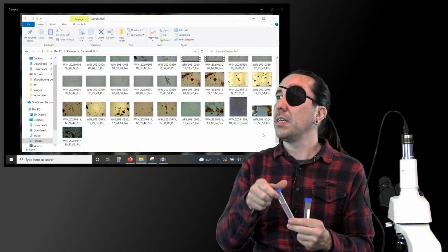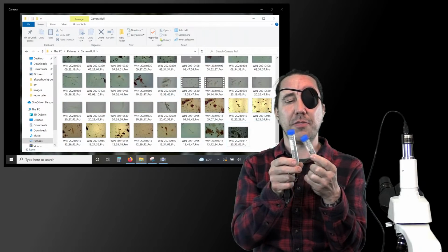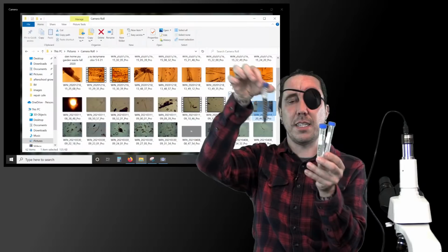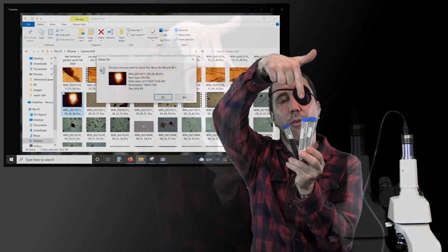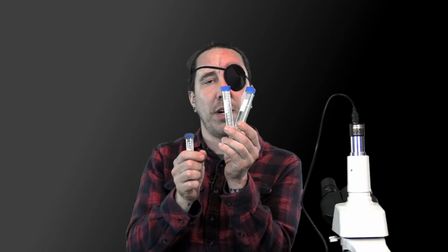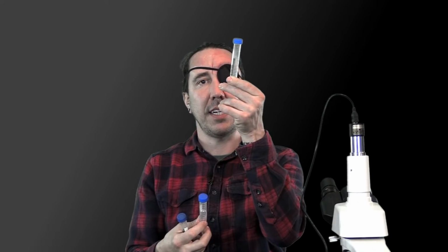We fill other centrifuge tubes up to 9 parts water, and then you take this 1 to 10 dilution, take 1 milliliter out of that, add that 1 milliliter to the 9 parts, so that makes a 1 to 100 dilution. Then you'd shake that up, take 1 milliliter out of the 1 to 100 dilution and add it to this. And then once you get to that 1 to 1,000 dilution, you'll start to be able to count the bacteria a lot better.